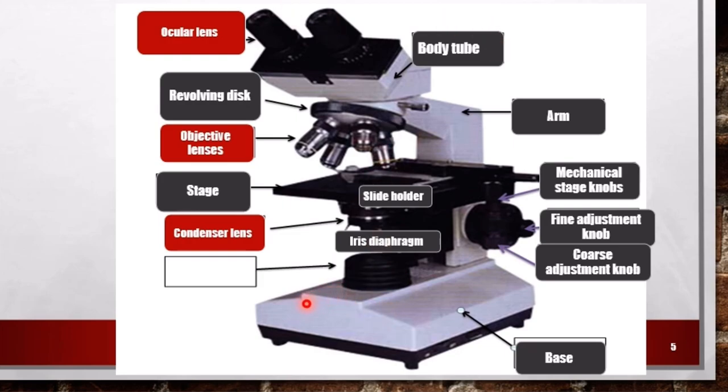The other parts, as well as mechanical parts and optical part, the presence of the light source. Usually, sunlight or electrical bulb light. In both cases, the wavelength of the light is limited.